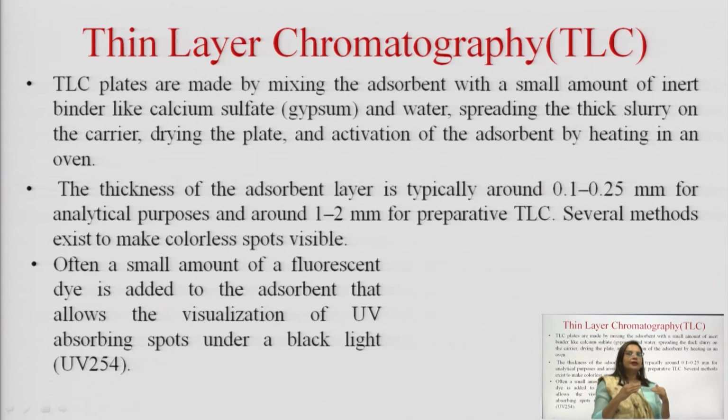Because water is utilized to make the slurry of the adsorbent silica gel, and if gypsum is added, it also needs water to initiate the binding state. This extra amount of water has to be removed from the plate so that the surfaces are free to interact with the solute and the mobile phase.